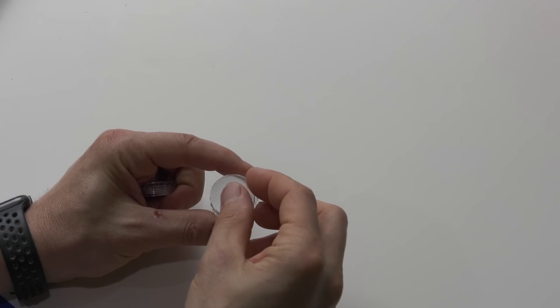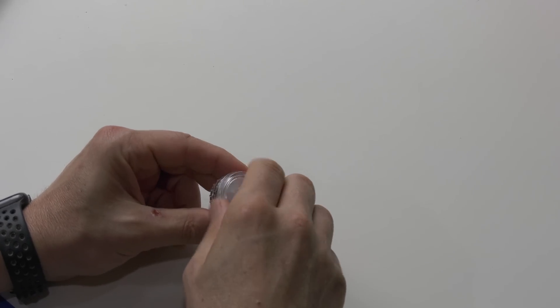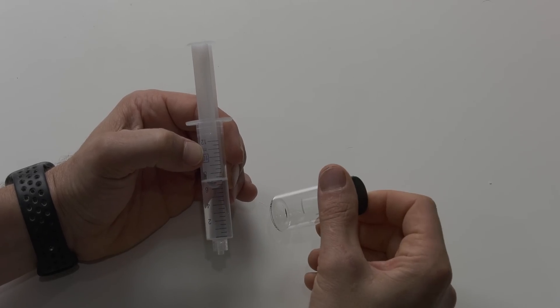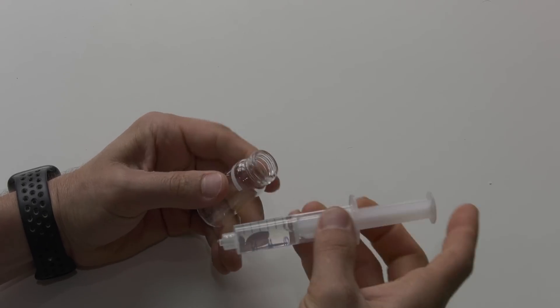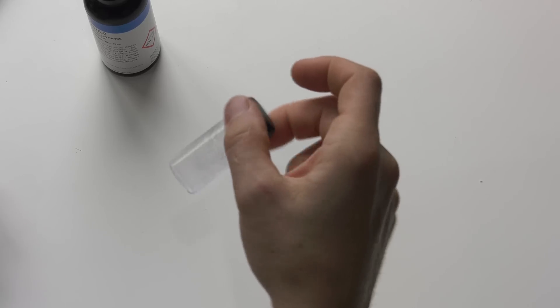First step: insert the paper filter into the filter holder, making sure none of the filter overlaps the side of the holder. The filter paper fits into the filter holder easily — this wasn't a problem. Then get seven milliliters of sample water from your tank and add it to the large mixing vial. Next, measure out four milliliters of reagent A using the included five milliliter syringe. Replace the cap and shake for one minute.